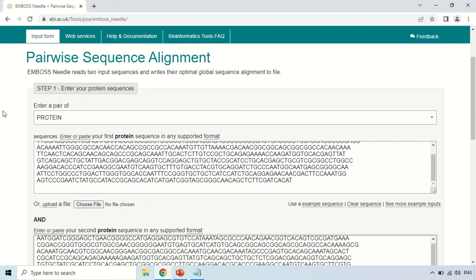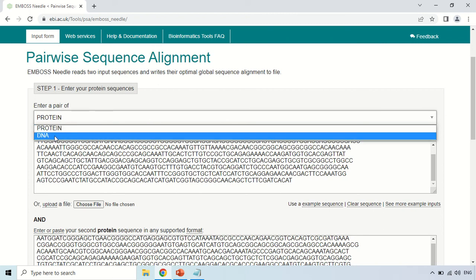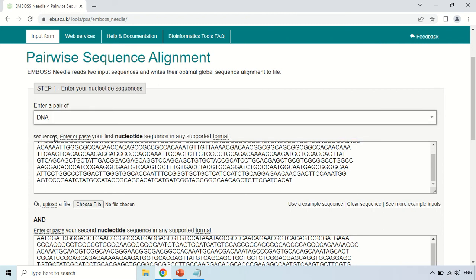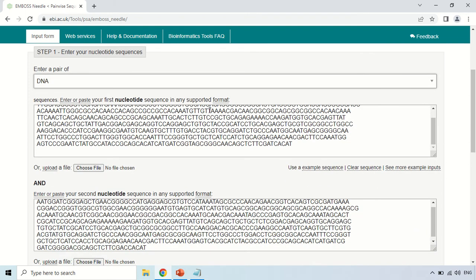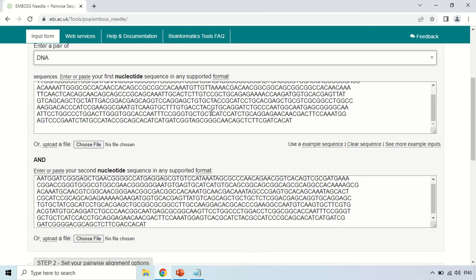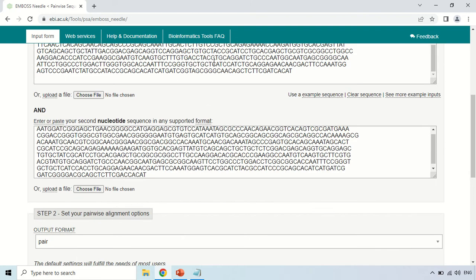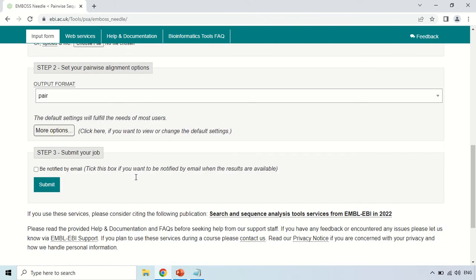Now change the sequence type according to your sequence. For example, if your sequence is a protein sequence, keep it as protein; but if your sequence is a nucleotide sequence, click here and change it to DNA. I am changing it to DNA because my sequences are nucleotide sequences.